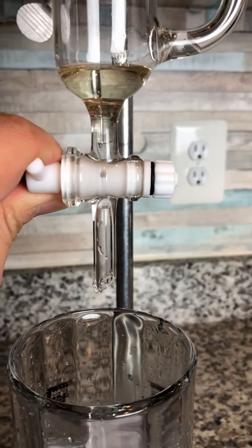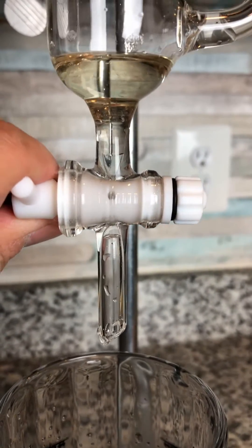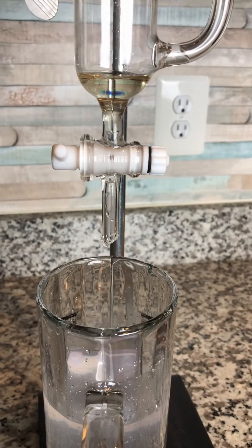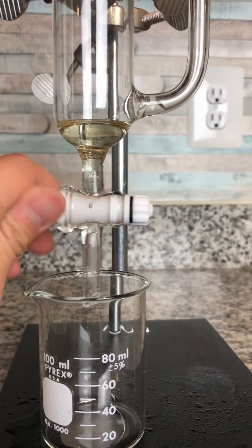Now you can see the interface is almost right at the neck — that's good. Then you can switch containers to your essential oil container and collect the rest. I use a little beaker to collect the essential oil.